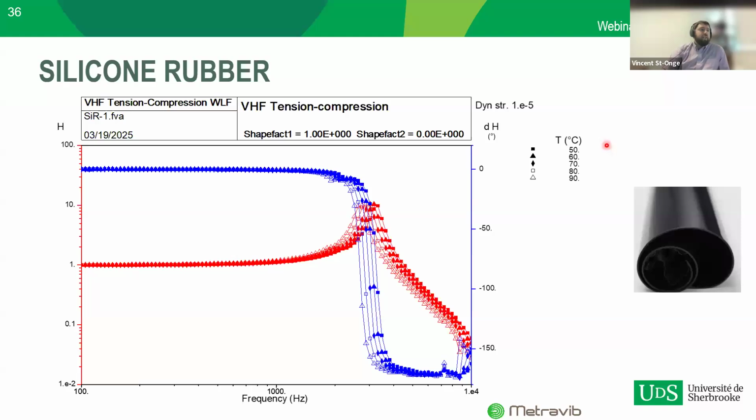So we ran the analysis at different temperatures to see how it would behave. And then you see that we always get the exact same curve. As we increase the temperature, the resonant frequency is shifting towards lower frequency, which is also something that is expected. And what you see now is that at close to 10,000 hertz, you start to see some weird things happening. So even though the theoretical limit of this sample would have been 40-something thousand hertz, because we get to see some weird things happening, we actually are limited in terms of upper frequency.